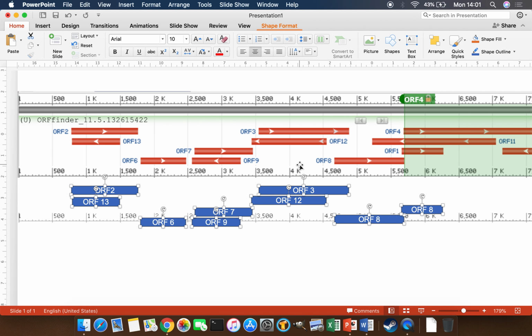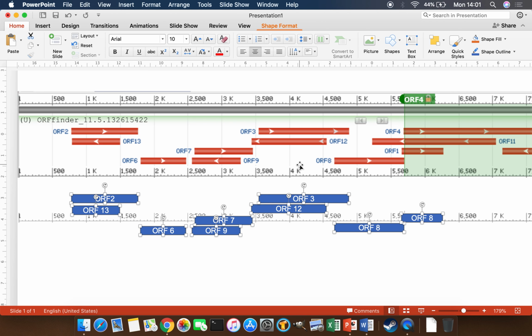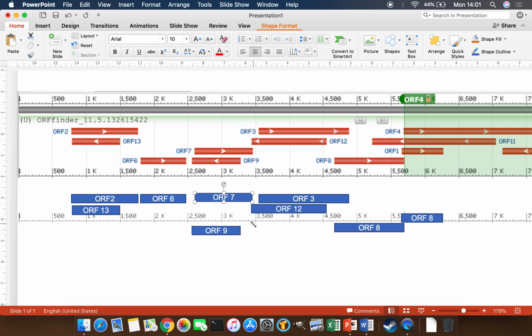Okay, now we want to separate these into ones that are going forward and ones that are going backwards. So look at the little arrow in there. I'll do this by bringing all the ones with a forward arrow up. I'm not moving them around with the mouse, I'm just selecting them and pushing the up and down arrows on the keyboard, because otherwise I know I would not get them in the right spot. And after I was so careful to get them all the right size, this is a nice thing to do. So I'm just moving up and down with the keyboard.